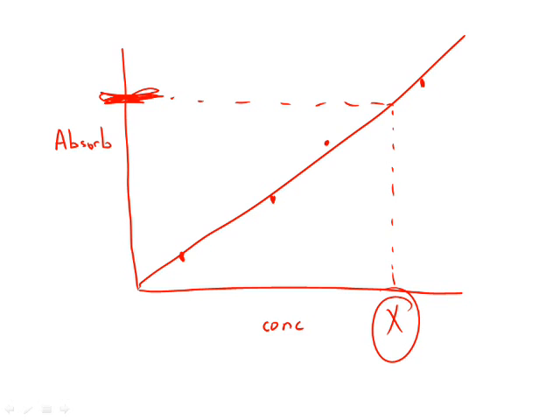And part 2 of the lab, if you're looking at the procedures there, the big idea is just to check your skills. Can you measure the absorbance of an unknown concentration of iron thiocyanate and find its concentration using this method?